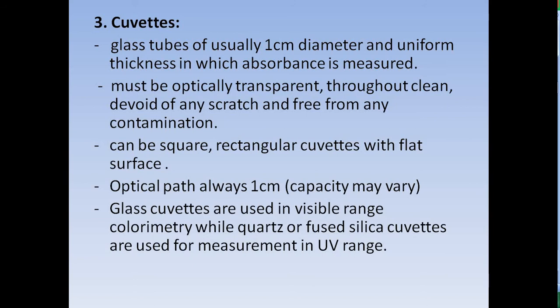Cuvettes are glass tubes of usually 1 centimeter diameter and uniform thickness in which the absorbance is measured. Cuvettes are the glass tubes in which we put the solution which we want to measure. It is optically transparent, thoroughly clean, devoid of any scratches and free from any contamination.